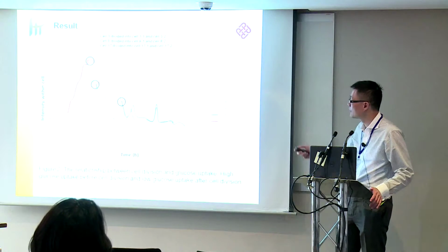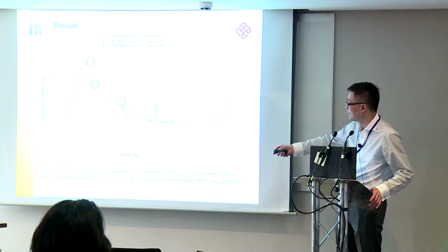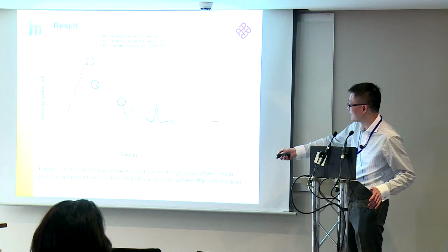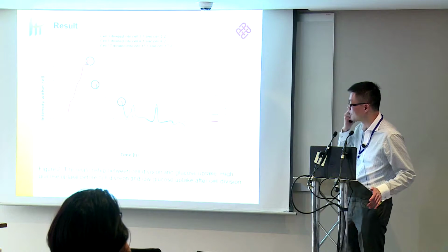So we investigate them one by one, and we find some interesting findings about the cell division. We find cells 3, 8, and 17 divide. Cell 17, the red line, divides into 2 cells at 3 hours, and the green one, cell 3, divides into 2 at 4 hours, and the third divides at about 6.5 hours.